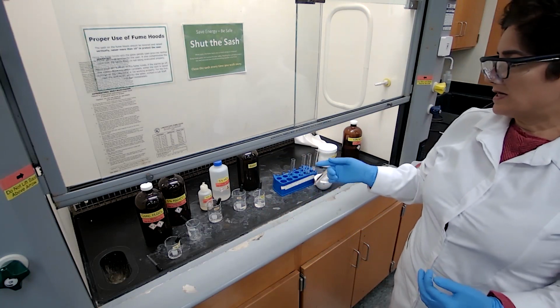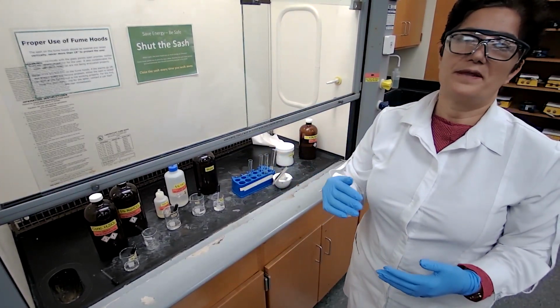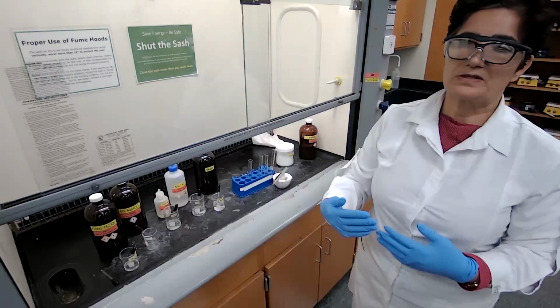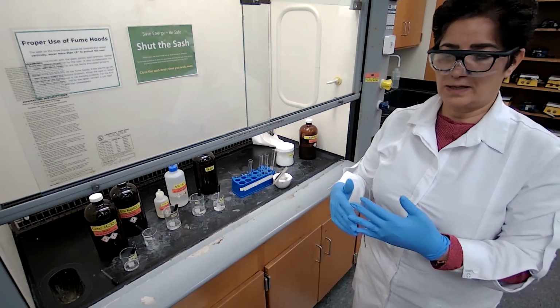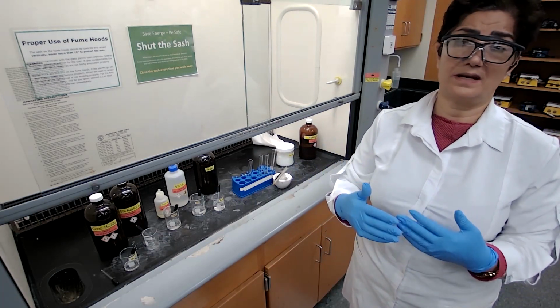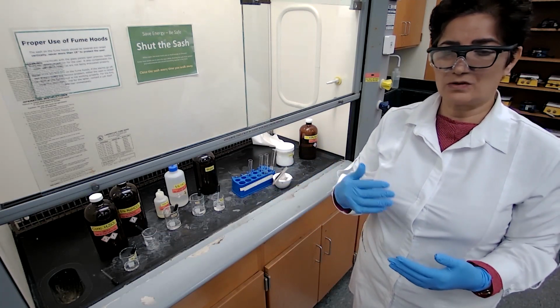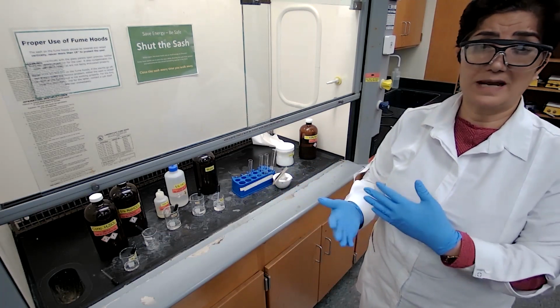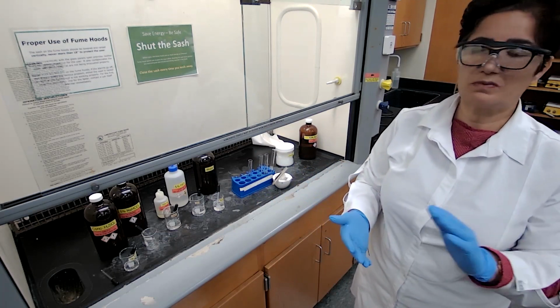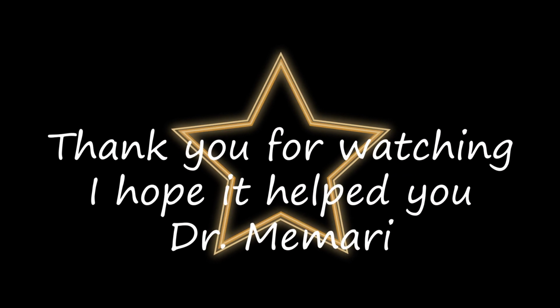With this, we just narrowed down the number of possible functional groups. So the next step would be our classification test. If the unknown forms a strong color with ceric ammonium nitrate, then it's an alcohol. If it forms a precipitate with 2,4-dinitrophenylhydrazine, then it's going to be either an aldehyde or a ketone, and that's what we are trying to do next.